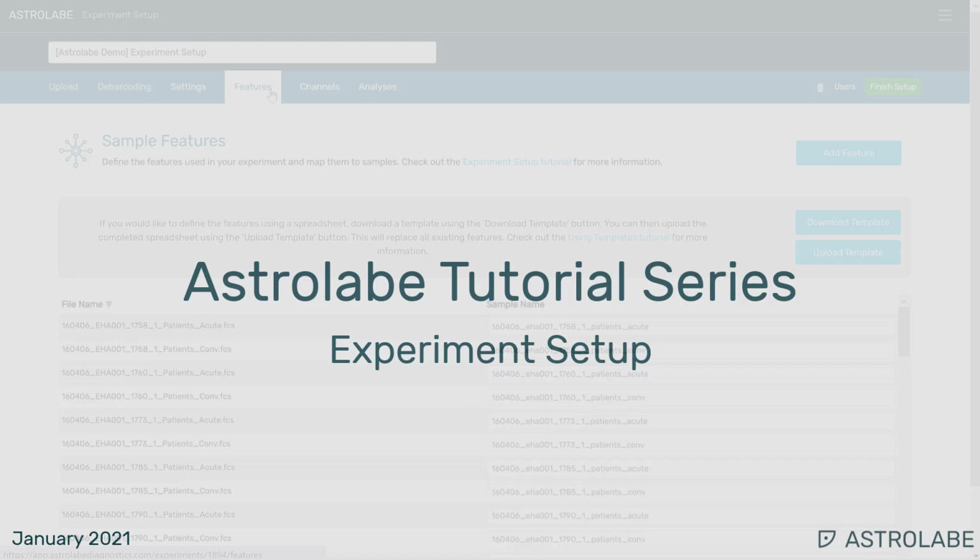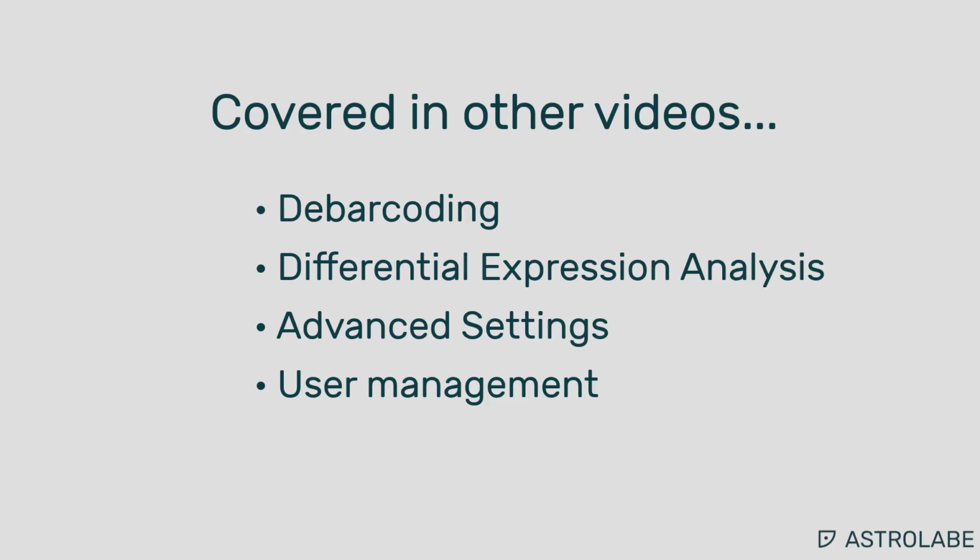In this video, I will show you how to set up a new experiment. There are some aspects of experiment setup, such as debarcoding and differential expression analysis, that are discussed in other videos. If you are ready for more advanced topics, please see the links below.